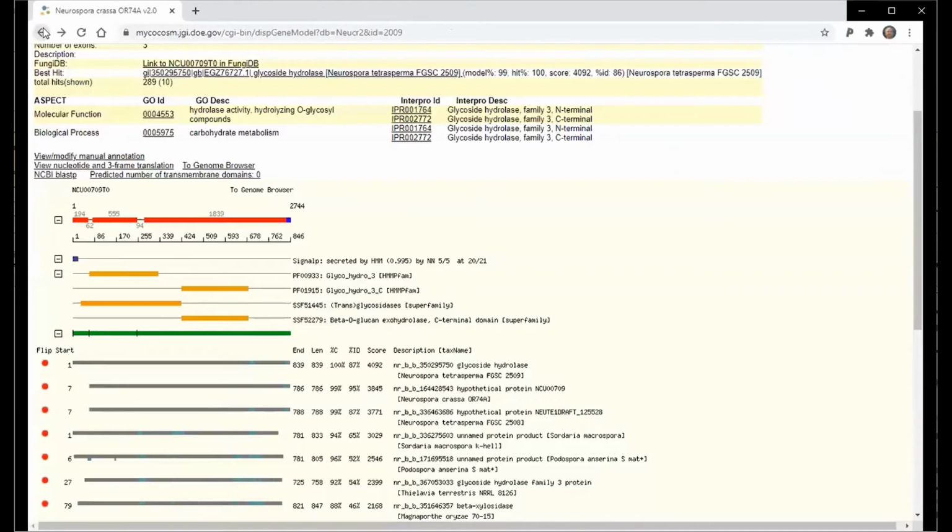We can go back to the protein page by using the browser. Immediately below this graphic is a scale bar showing the length of the translated protein sequence. Any annotations, where available, are shown after that, SignalP in purple and protein annotations in gold. Clicking the SignalP text next to the graphic will show details from the SignalP run. Clicking the text or images of the annotations will link to external databases.